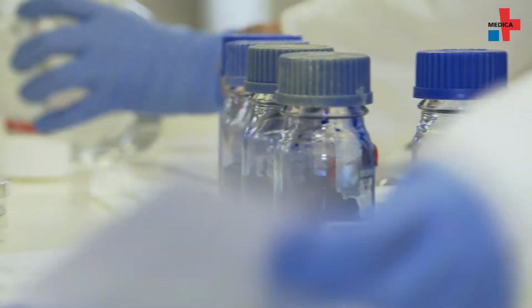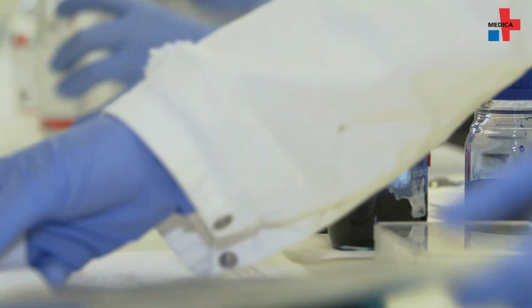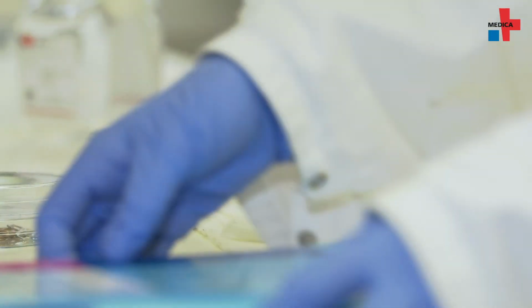We use human cell material to make our organ chips. We're well aware that we would have difficulties finding test subjects to test a new drug. We know many clinical trials that have failed because the test persons were subjected to severe harm. That's why it's difficult to find people who are willing to sign up during early phase clinical trials.